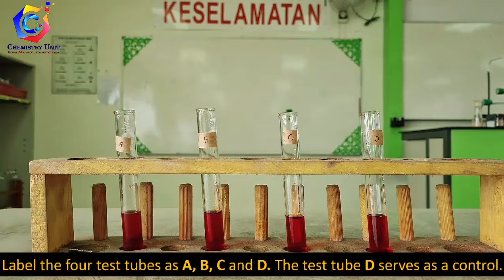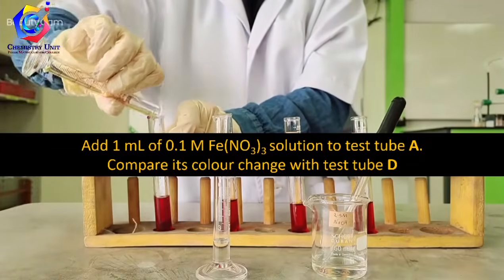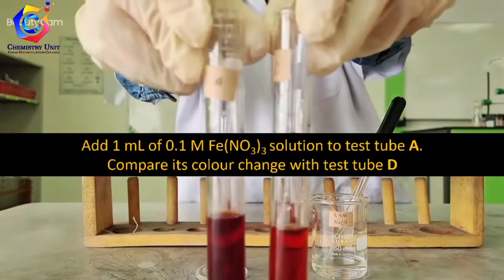Label the 4 test tubes as A, B, C, and D. Test tube D serves as control. Add 1 ml of 0.1 molar iron nitrate solution to test tube A. Compare the color change to that of test tube D, the control.